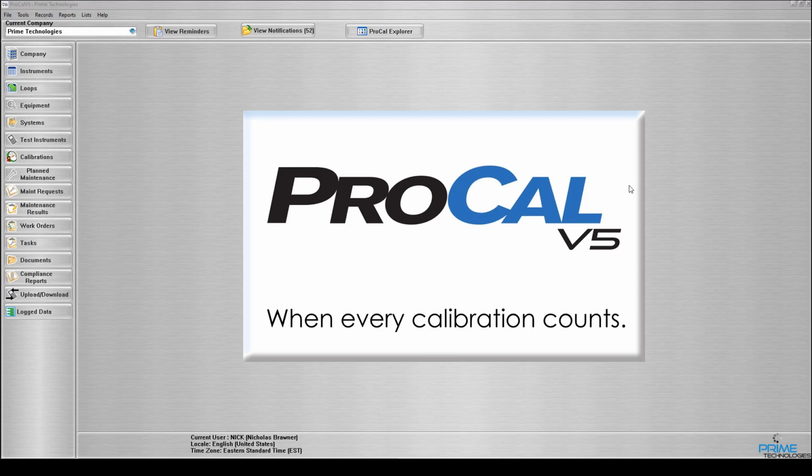The Scales and Balances test type package allows you to verify the accuracy of a scale or balance. Before getting into the setup and use of the Scales and Balances test type package, I'd like to go over three definitions you'll need to know before moving forward.